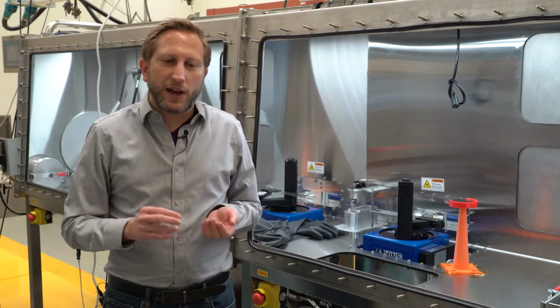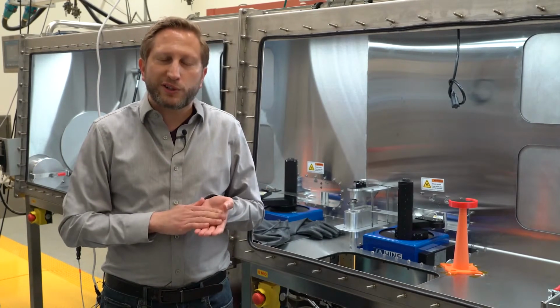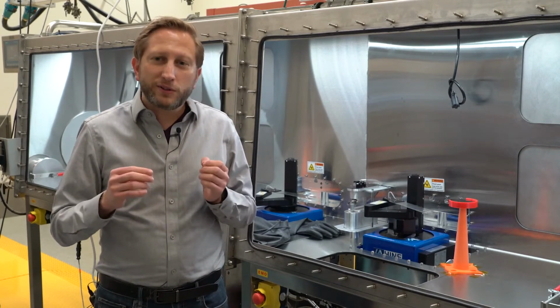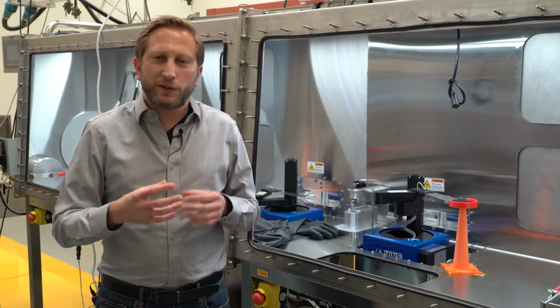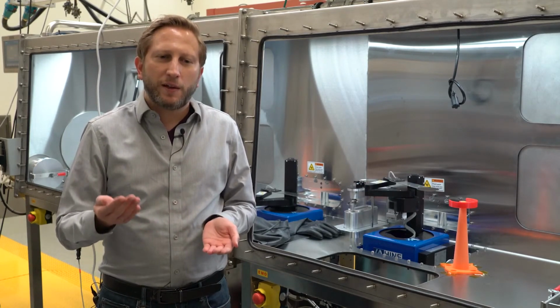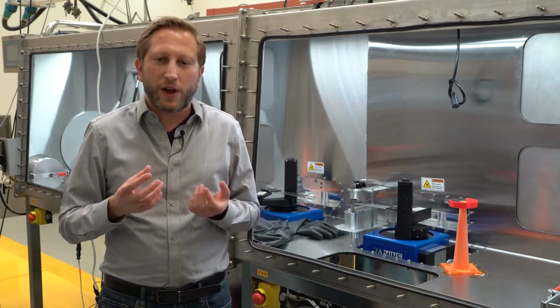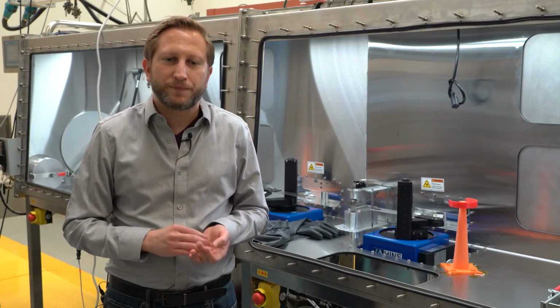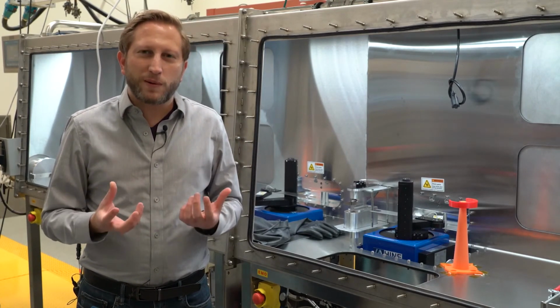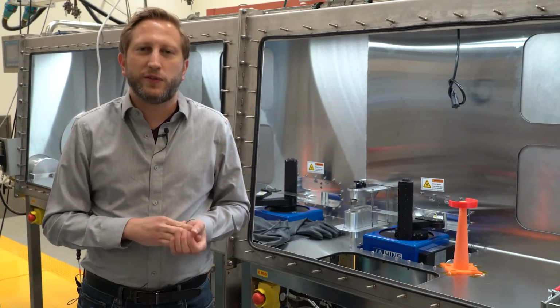These will do things like exfoliate the material from the bulk crystal so you can get exactly the flakes you want, look around using machine learning to find the best flakes that you need for devices, and then precisely and quickly assemble these, eventually all without direct human input. So this is really something we believe will transform the whole science of 2D material device fabrication.